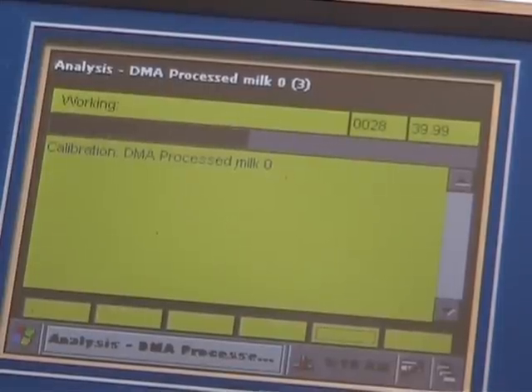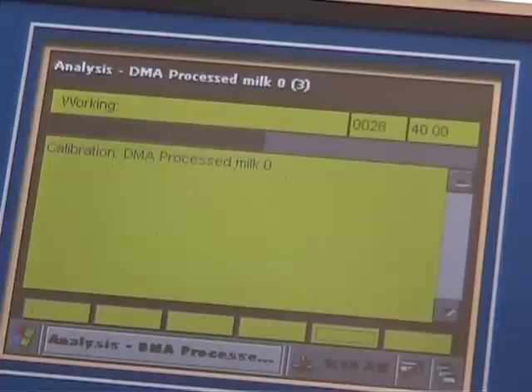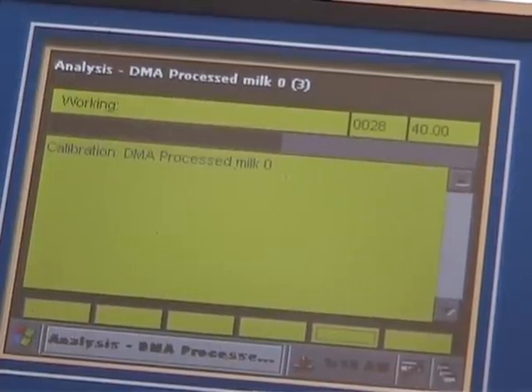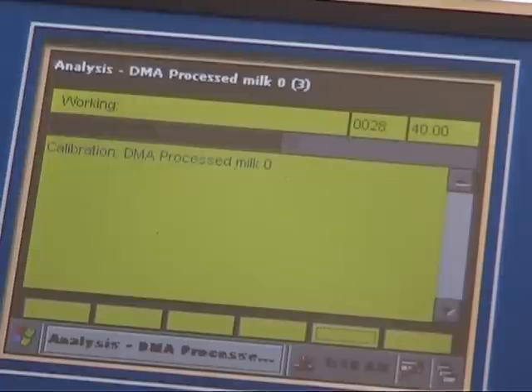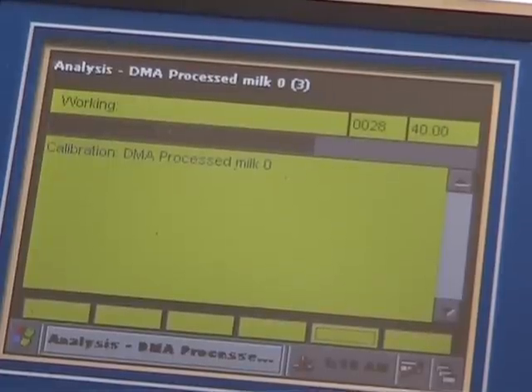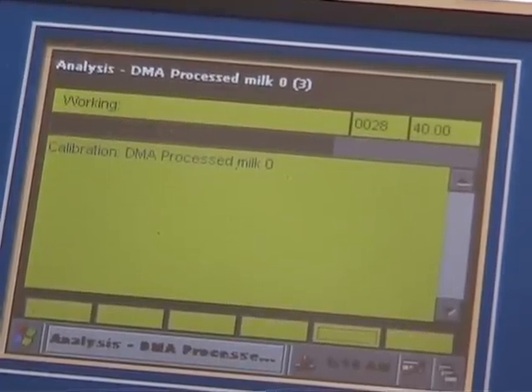The milk analyzer can analyze both homogenized milk and un-homogenized milk. It has two modes. In this case, we're analyzing homogenized milk.